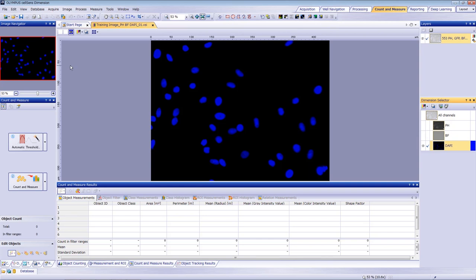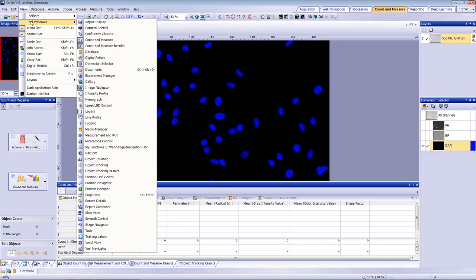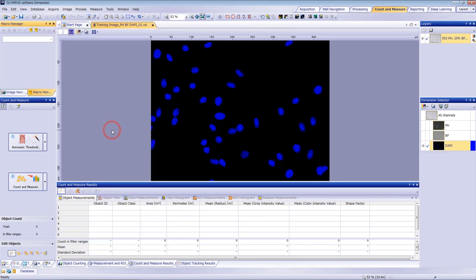Since we have to do this for multiple images, record it as a macro. To do this, open the Macro Manager tool window on the menu bar. Click Create Macro and name it to create the training label.